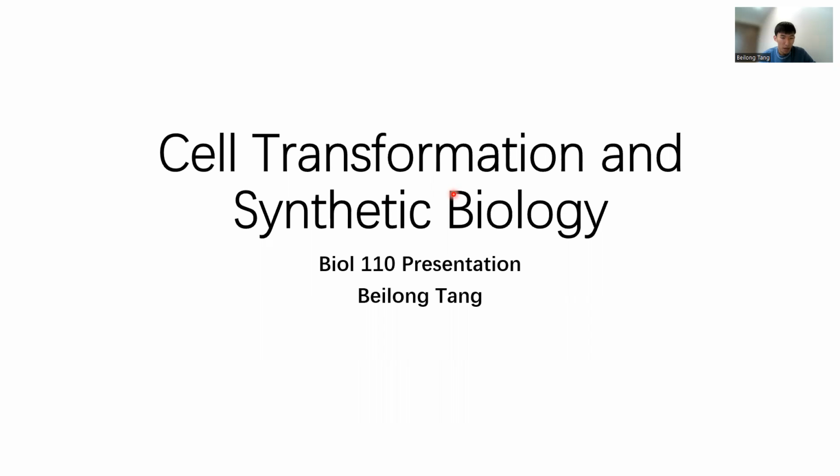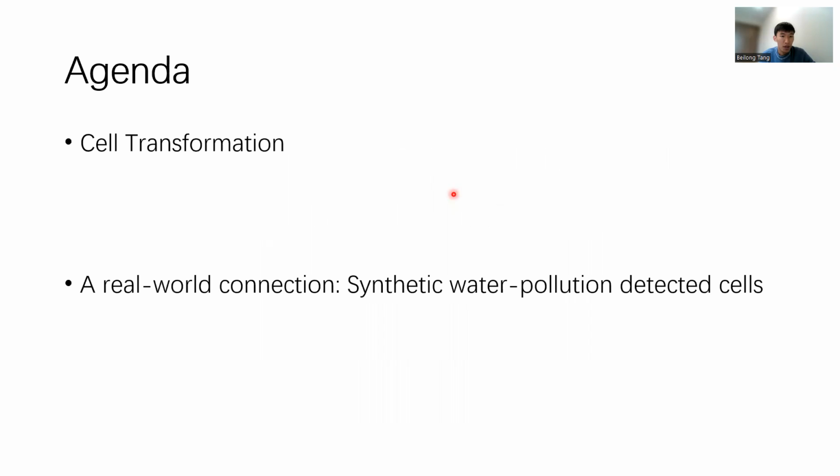Today I'm going to talk about cell transformation and a little bit of synthetic biology. First, I will talk about the principle of cell transformation, which is conducted in Lab 6. Second, I'm going to talk about my real-world example of using cell transformation: synthetic water pollution detection cells.